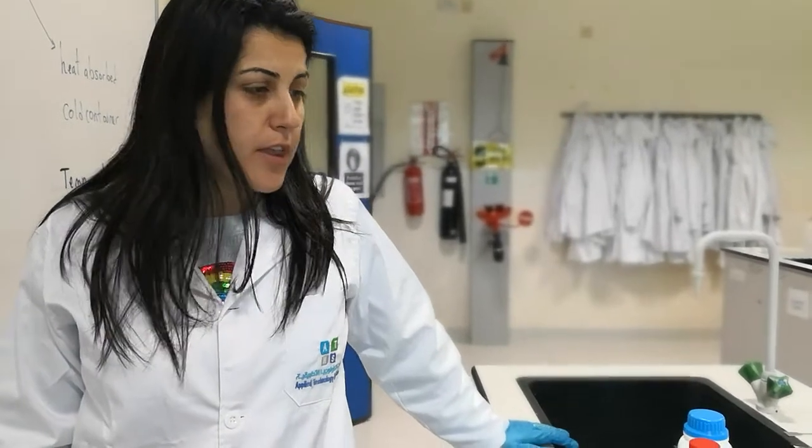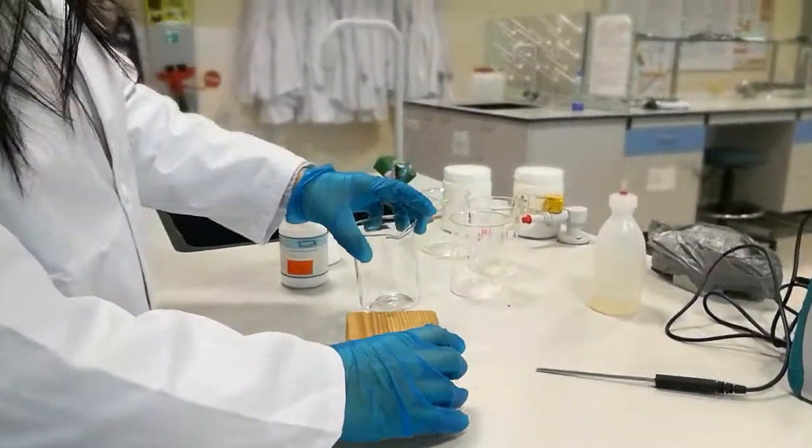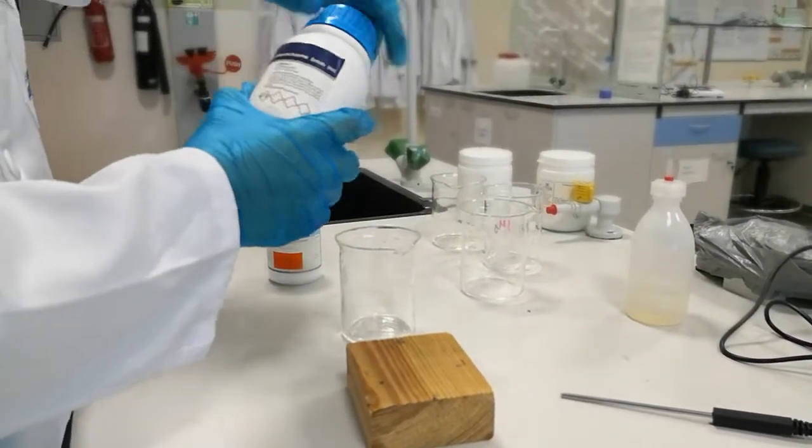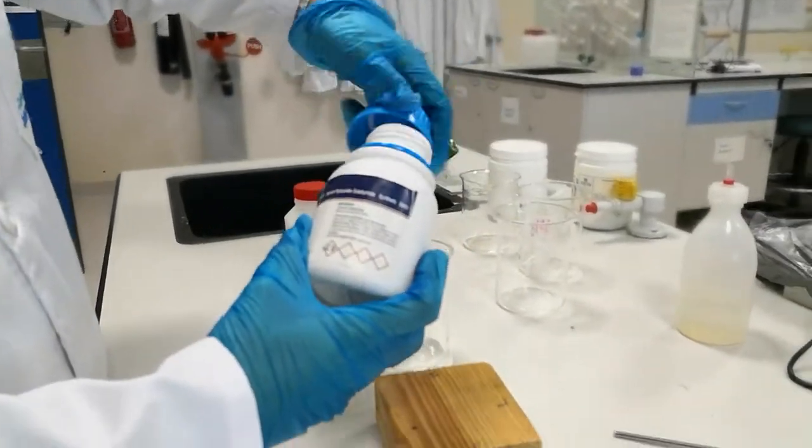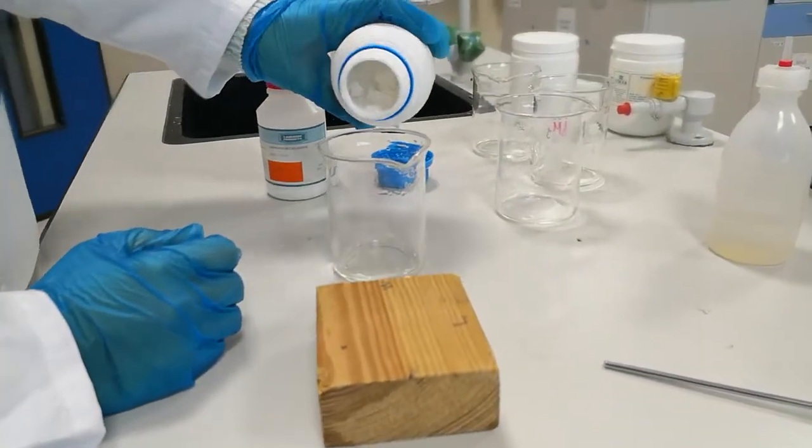I am going to do two experiments today to demonstrate exothermic and endothermic chemical reactions. First, we are going to do an endothermic reaction where I add barium hydroxide and ammonium chloride together.